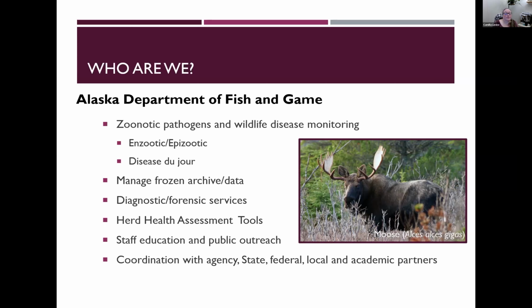Our group manages an archive of frozen samples, also some that are not frozen, as well as a lot of the data that has been collected over the years for Fish and Game. We offer diagnostic and forensic services. So when there are mortalities, we will do necropsies and do samples and try and come up with why that animal was found dead.